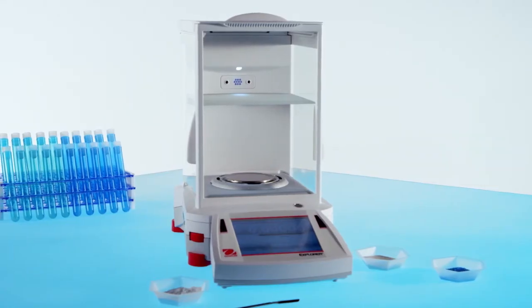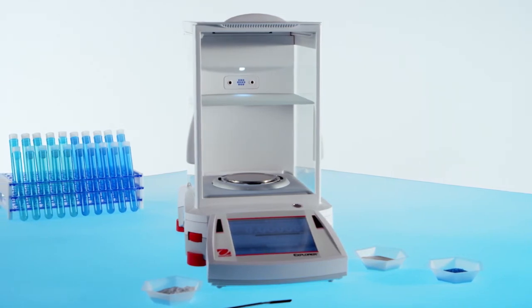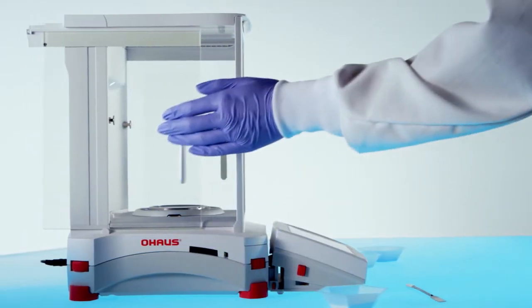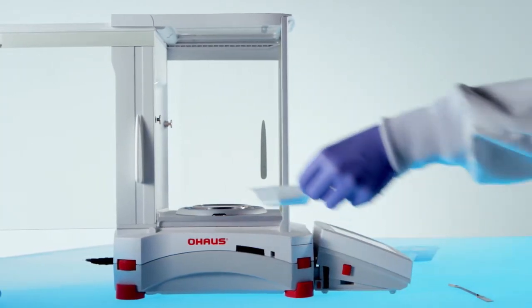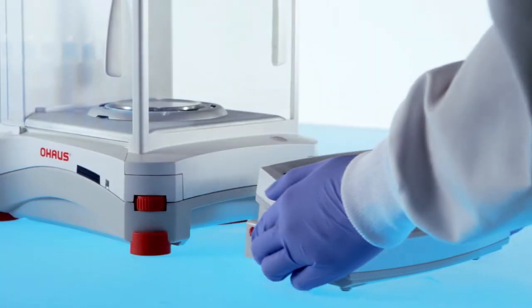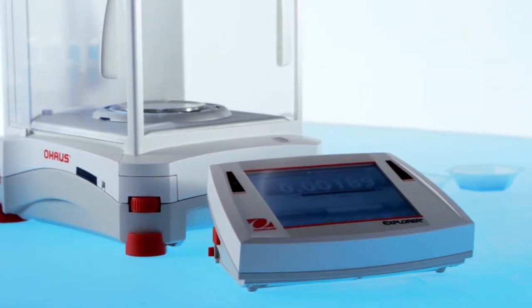Explore the advantages of its ingenious construction with a responsive color touchscreen, four touchless sensors, automatic doors, a built-in ionizer on select models, and a convenient detachable display.